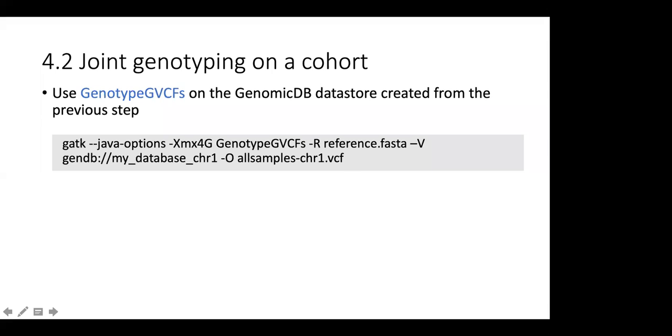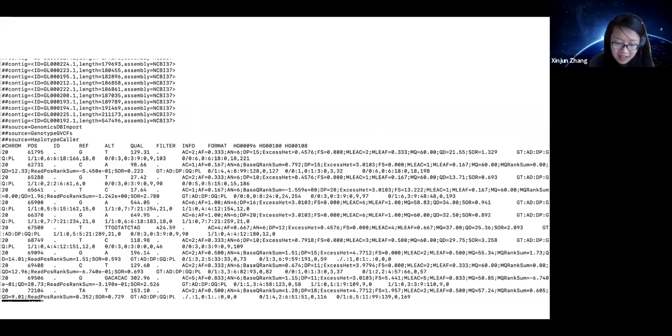Yeah. So this is a sample of how this output looks. This is just the raw VCF, and the way we read it is the same as how we explained yesterday. It contains all the header information. And here we can see that other than the first 9 columns that are shared in every VCF, we have the 3 individuals that we called genotypes for.